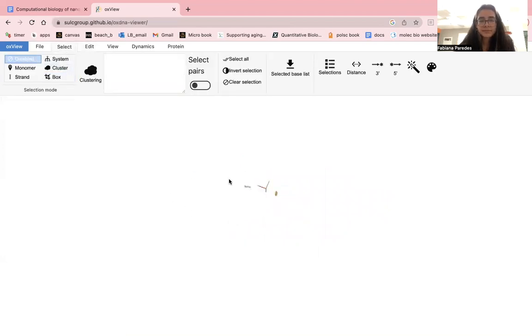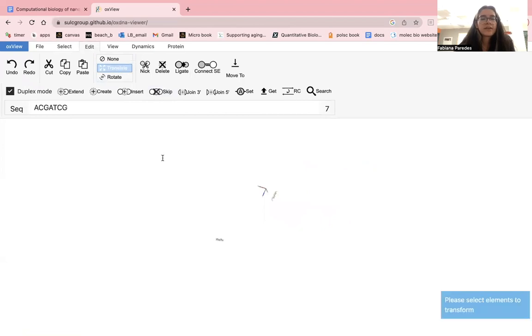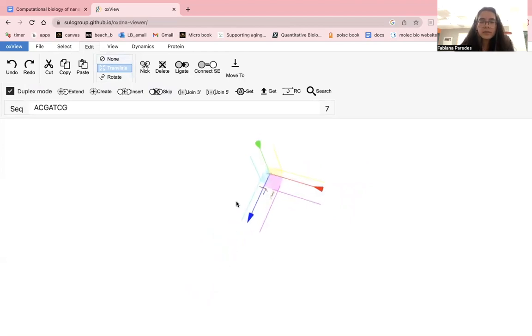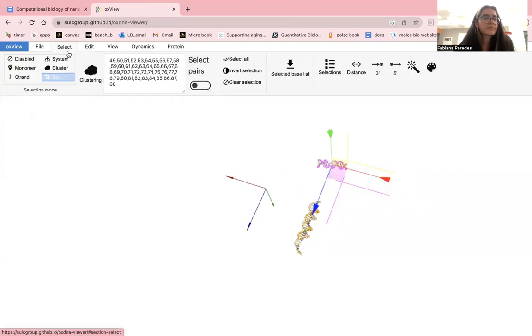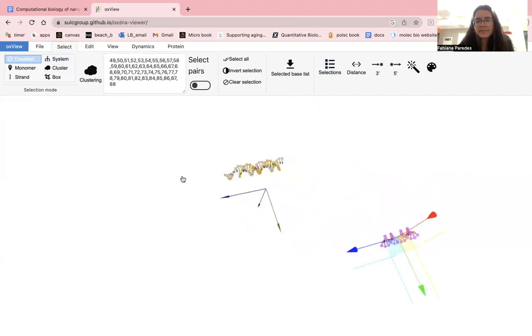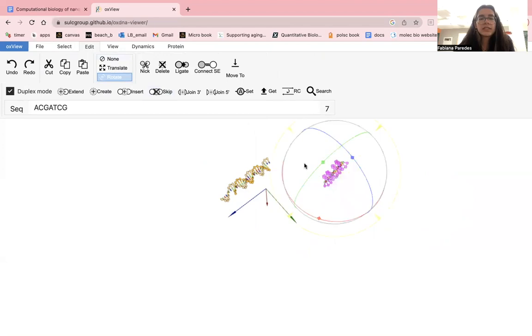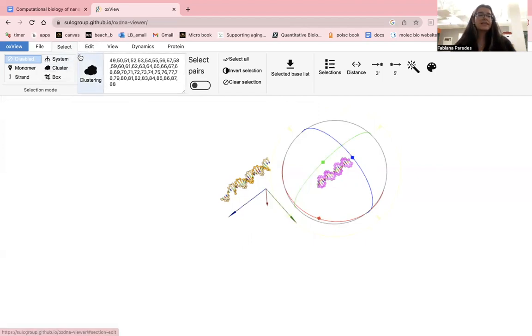Oops. Okay. And I think this will be the last movement we have to do. I really wish we could. Okay, yeah, that's close enough. Let's get her higher. Okay. Stable. Yeah, okay. They're definitely closer than before. So we can say that this is strand 1, this is strand 2, and also if you want to have it lay on the same orientation, you can click on rotate and you can move it around. There we go. Okay. We can go back and add whatever is left.